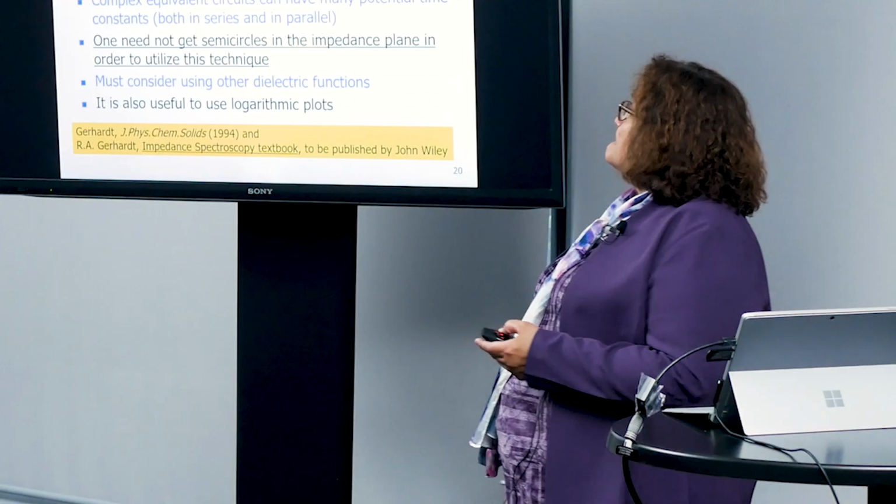And one need not get semicircles in the impedance plane in order to utilize this technique. And one must consider the other dielectric functions. And finally, it is useful to use logarithmic plots because when the values are very, very different, you need to be able to see if you have some other features that you may have missed.